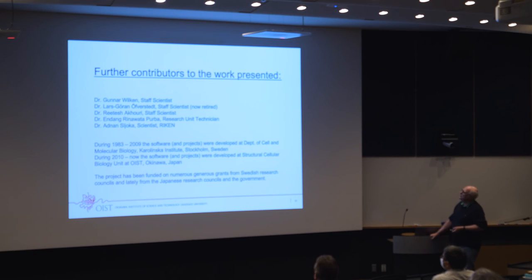I would like to say that there are many contributors to this work. So Gunnar Wilken, he is sitting there. He has been important for us to sober up our way of using some of the mathematics in COMET to a very important step where it's very accurate and can be used to high resolution. I did a test on a nanoparticle, a silver particle, and there you see the lattice. So you have the silver atom distance and see every silver atom in some area. So it's rather accurate on this kind of stuff.